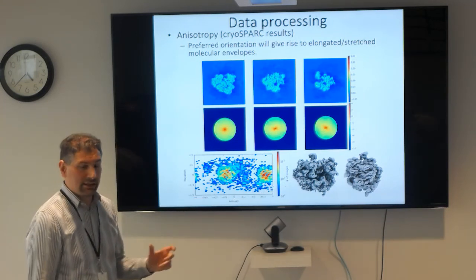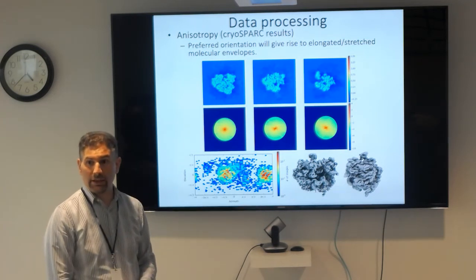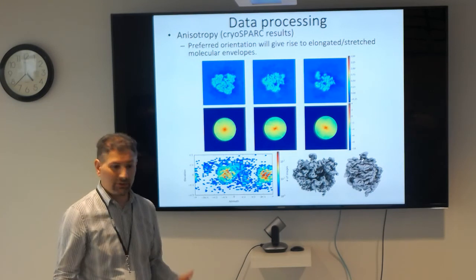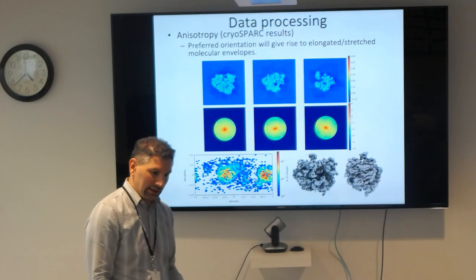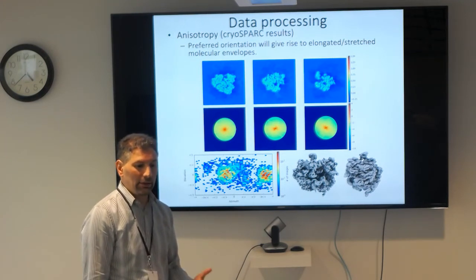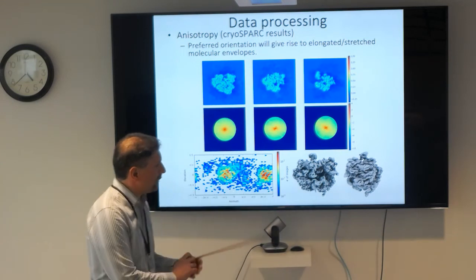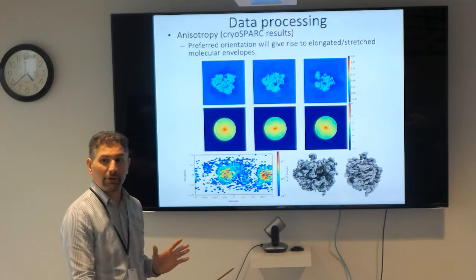And I think the 3D classification is actually pulling out the data with preferred orientation, and the rest is the data that does not have any preferred orientation. So I don't think it's a biochemical thing or a bad particle thing. I think the 3D classification, at least in a couple of examples we've had, is actually dealing with the anisotropy problem. You can imagine that this will give you a good reference, whereas this at a lower resolution will give you a smeared out reference, right?